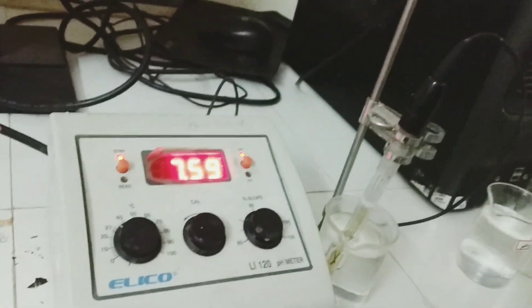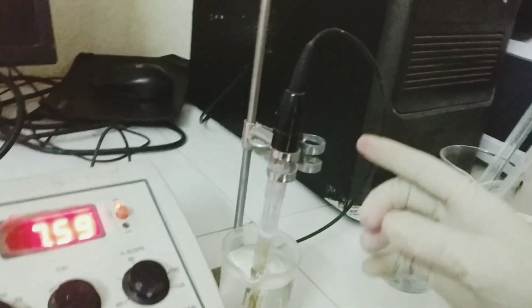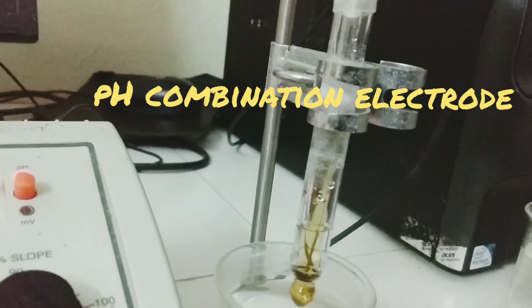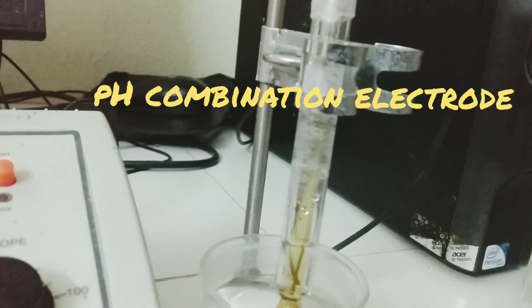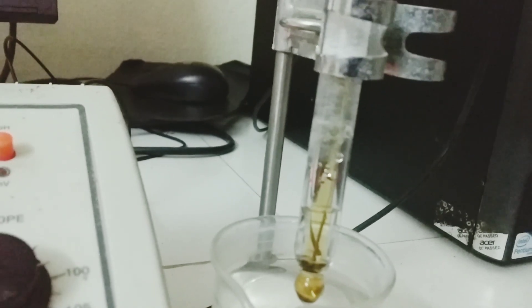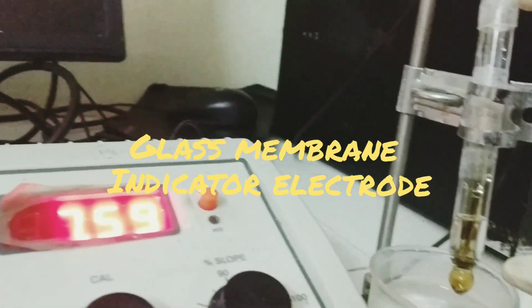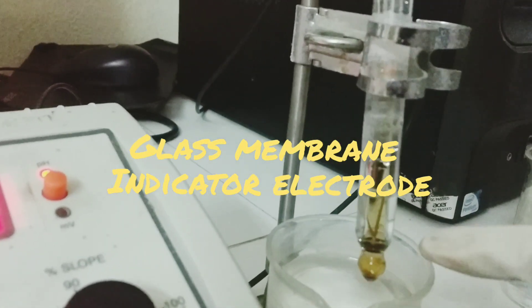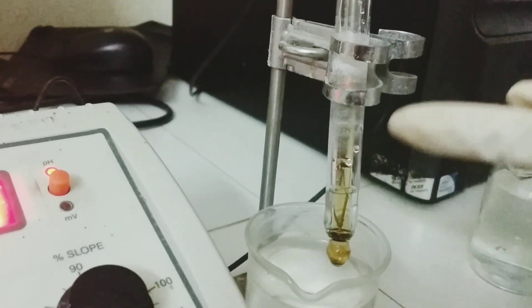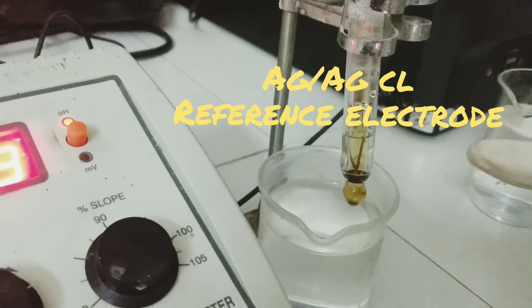The very important part of this instrument is the electrode. This electrode is called a pH combination electrode because it is a combination of two electrodes: the indicator electrode and the reference electrode. The indicator electrode is the glass membrane — you can see the glass bulb at the tip of the electrode. This glass bulb acts as the indicator electrode and measures the pH of the solution into which it is dipped. Inside the electrode, there is another probe called the reference electrode, which is a silver-silver chloride electrode.